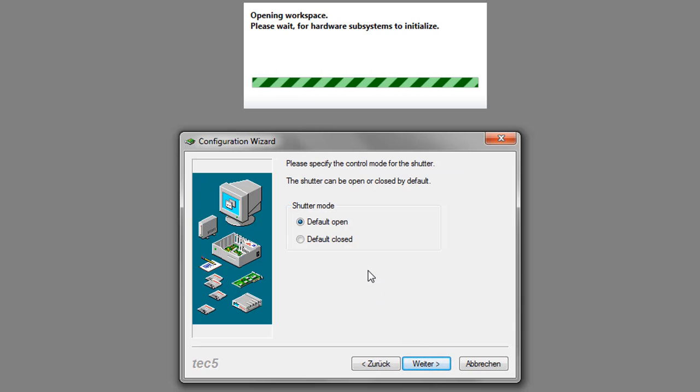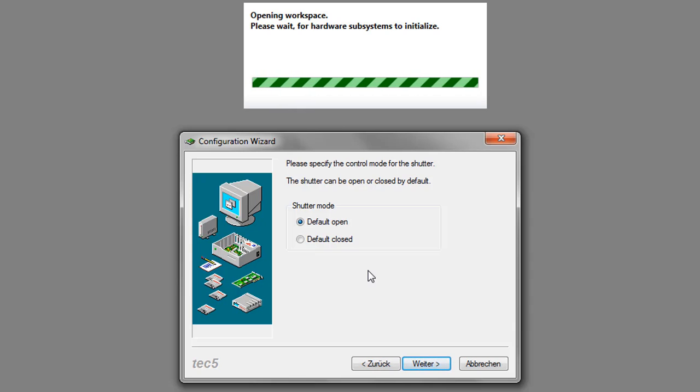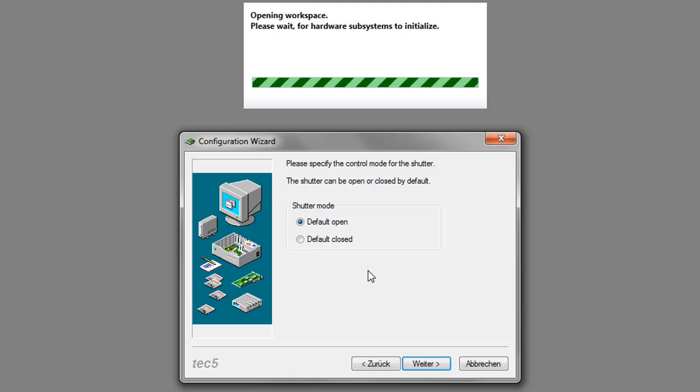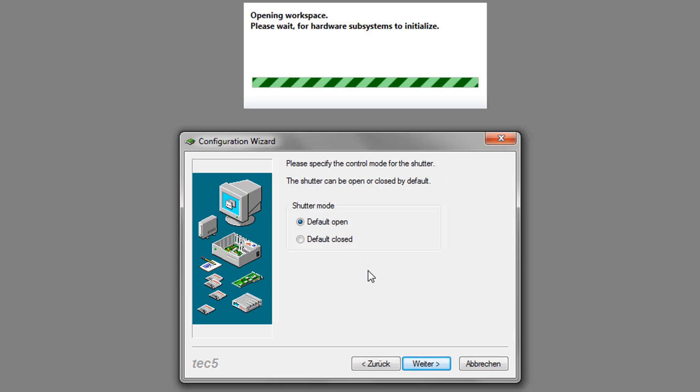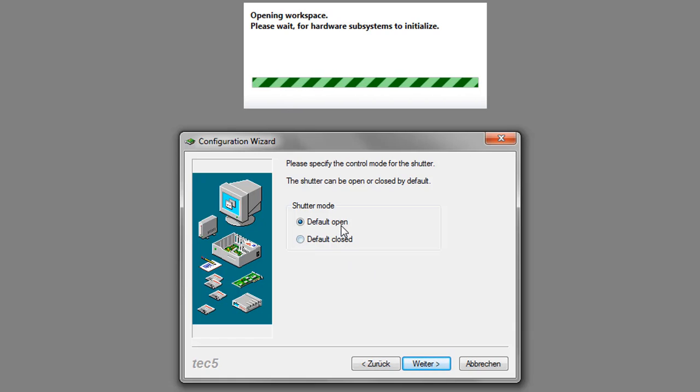Finally, you have to decide on the shutter mode. The shutter can be either closed between the measurements, that would be default closed, or it is opened all of the time except for dark measurements, which is default open.